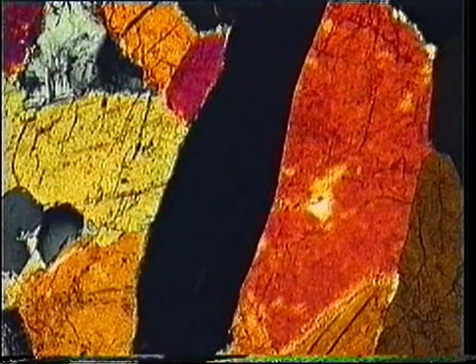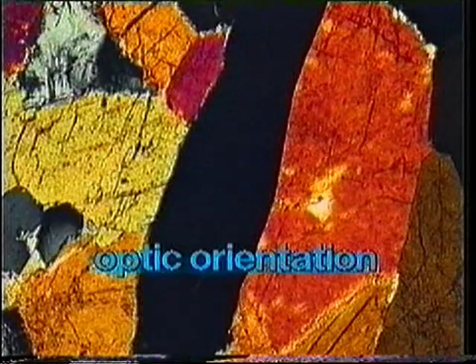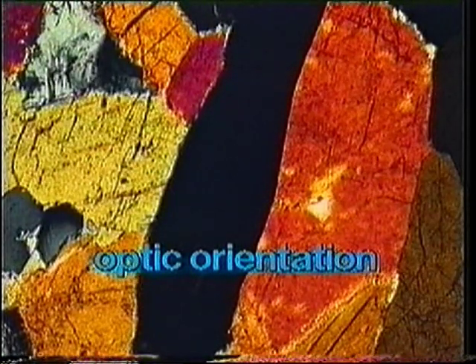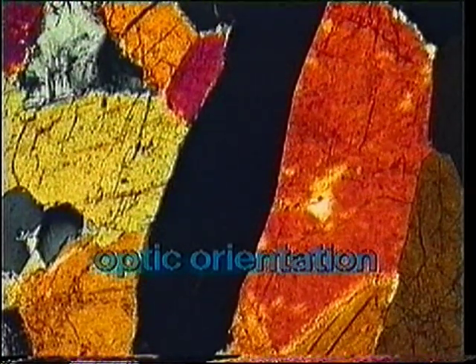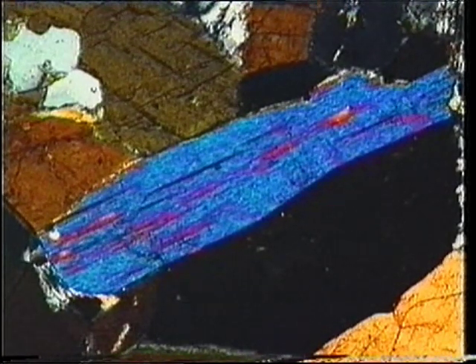We know the vibration directions are X and Z, but we don't know which is which. Rotate the stage 45 degrees clockwise so the vibration direction that was north-south is northeast-southwest. Add the plate. There's a rise to third order blue.